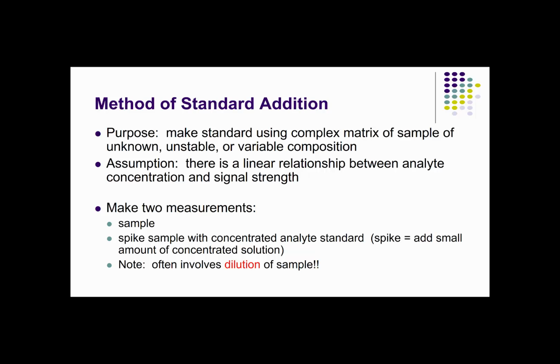And now you make that absorbance measurement for this mixture sample. Now, the reality is we often add a non-negligible volume of standard solution, and so please be careful, as you may need to take into account dilution of your standard and your unknown in your mixture sample.